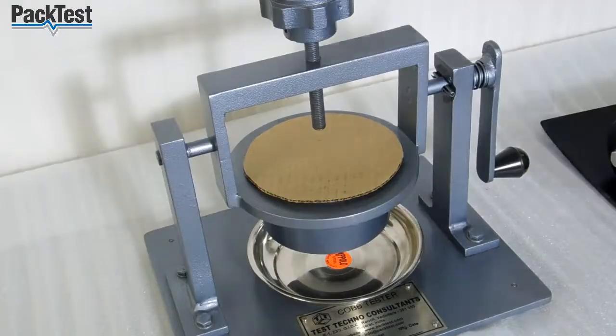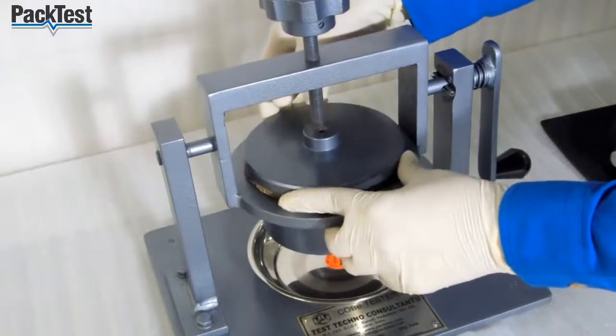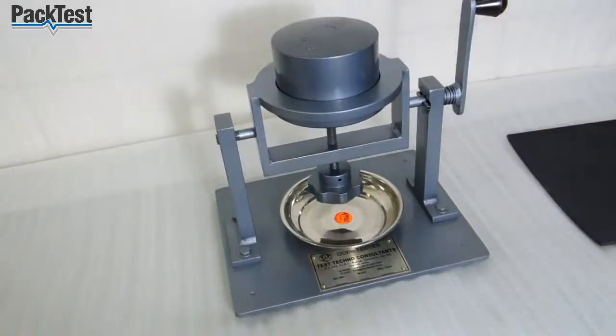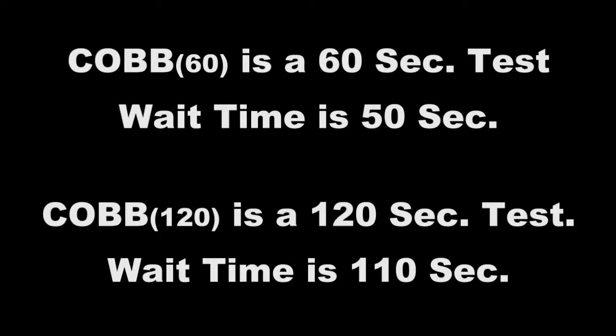Place the lid on top of the sample and tighten the screw knob to hold it firmly. Use the handle to turn the testing station upside down. Wait for 50 or 110 seconds in this position.